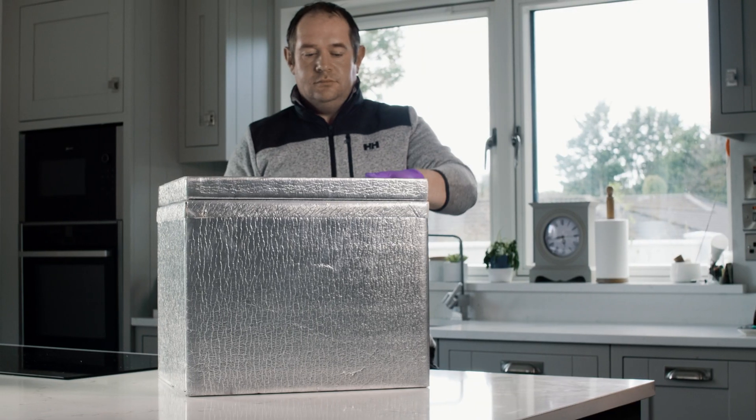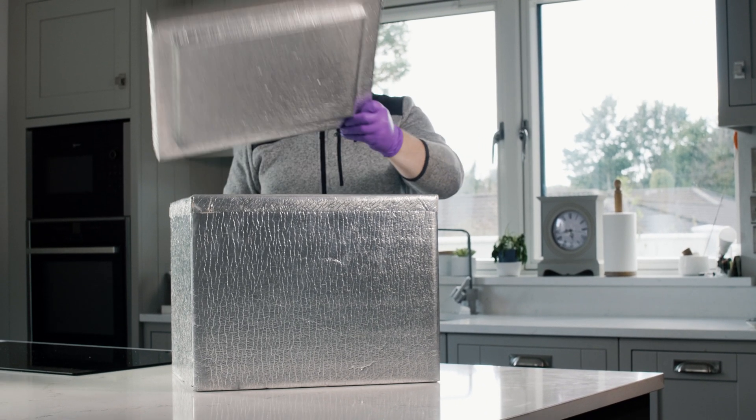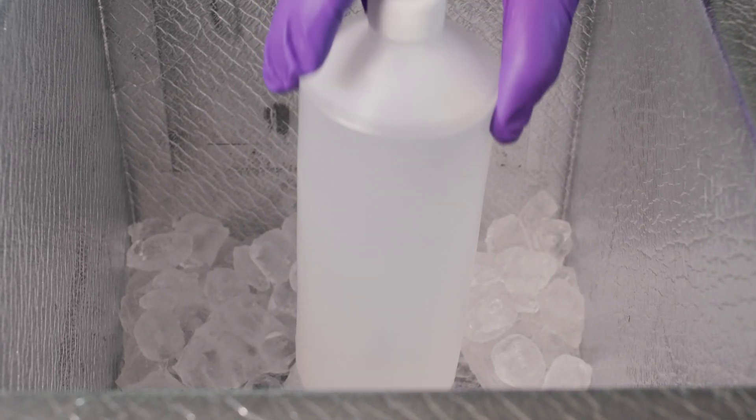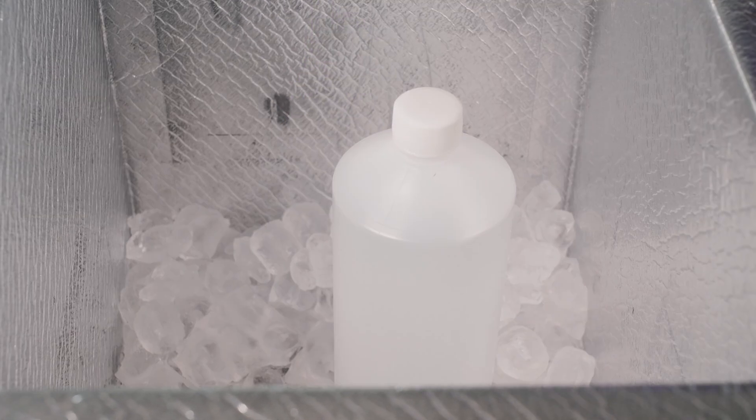7. Take the sample and close the bottle once filled. 8. Place the bottle in a cooler box with ice or ice packs that are PFAS-free. PFAS samples should be stored separate to other samples.